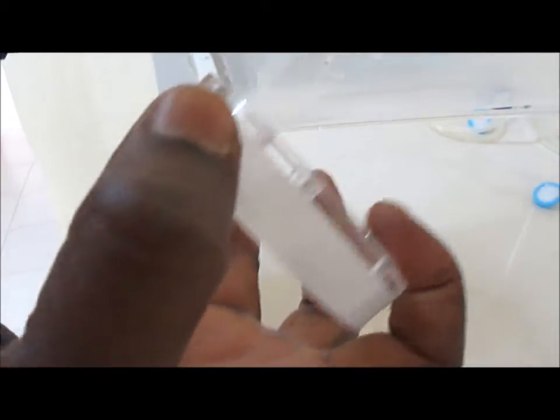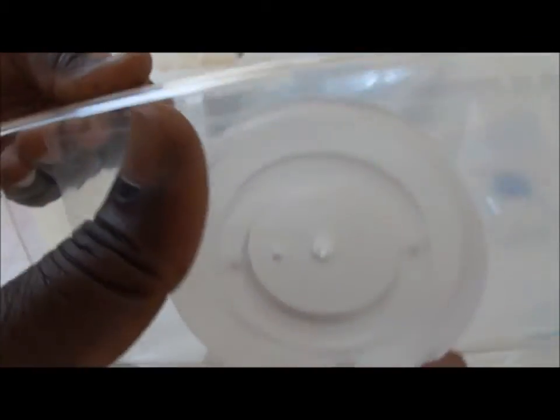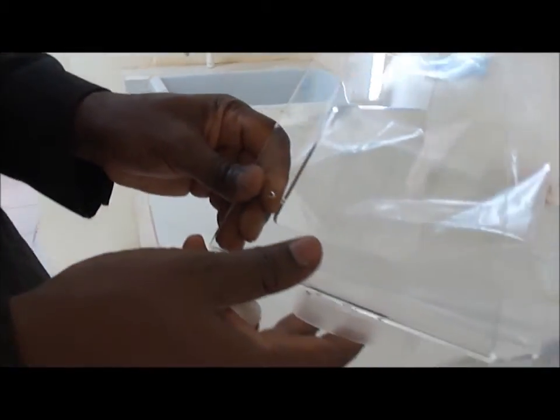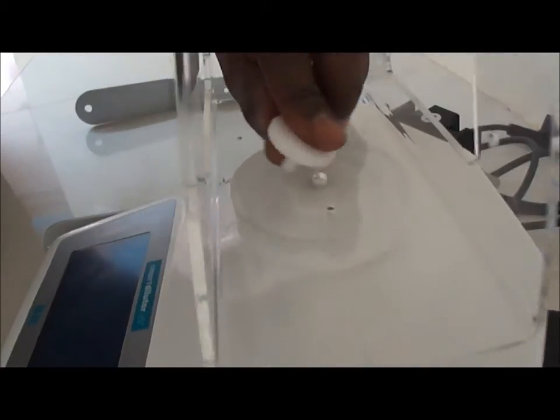And at the bottom you see this disc with two small sticks that will be inserted into the two holes you see here, and then you insert this way and you maintain all this thing on the top of the central device here, on the top of it, using this small screw in form of disc. This is mounted this way by screwing inside.